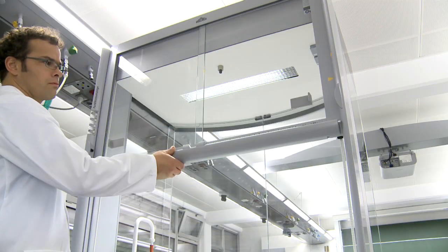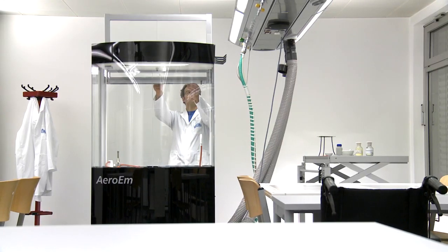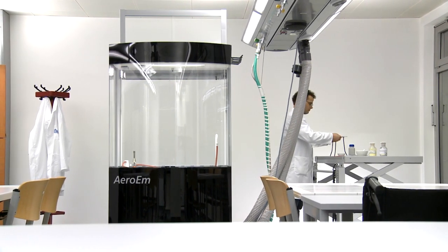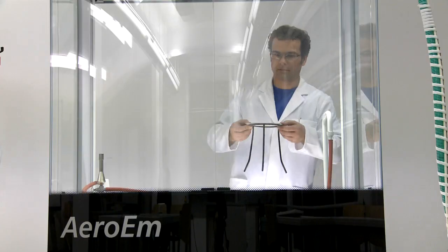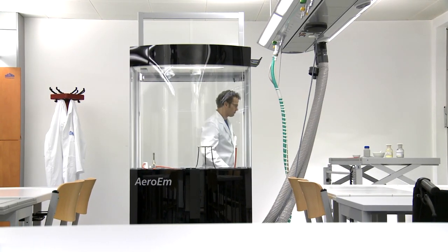The Aero EM has a completely transparent upper part made from safety glass, allowing its working space to be observed without restrictions from all directions. The impact panels made from safety glass are double-walled and can be opened inwards for cleaning.